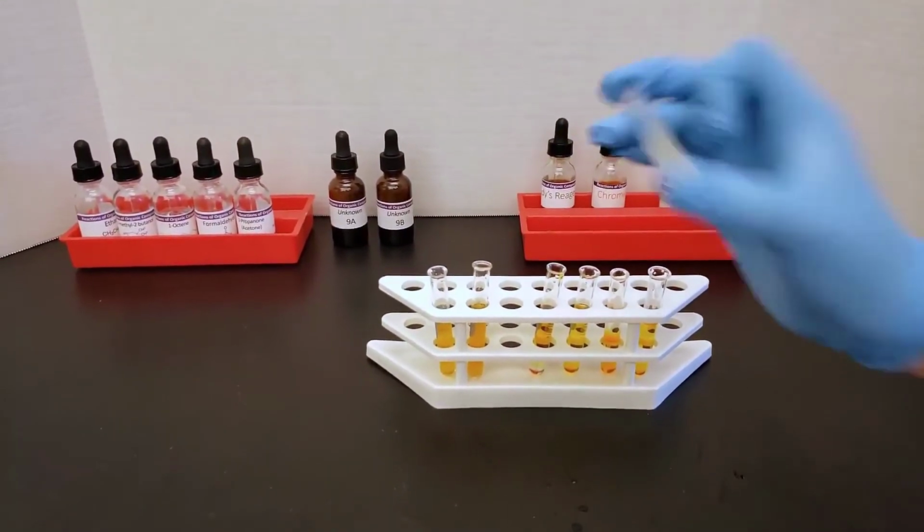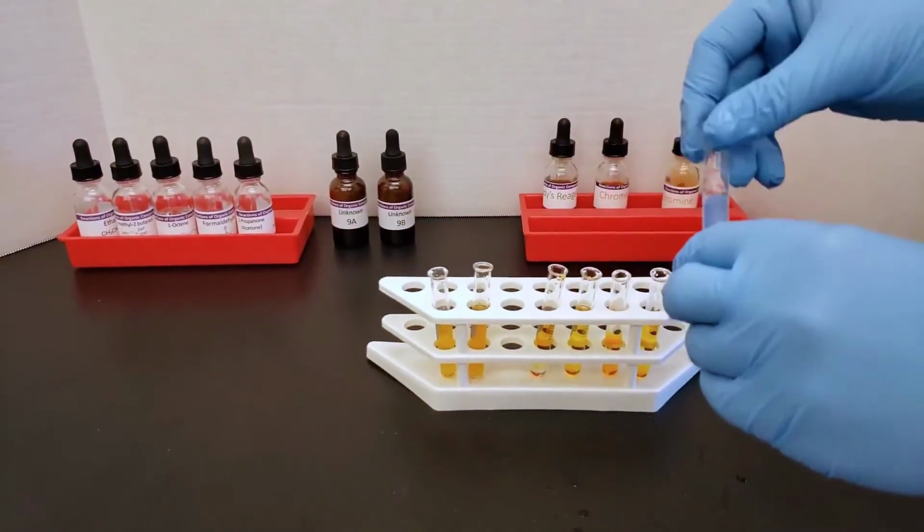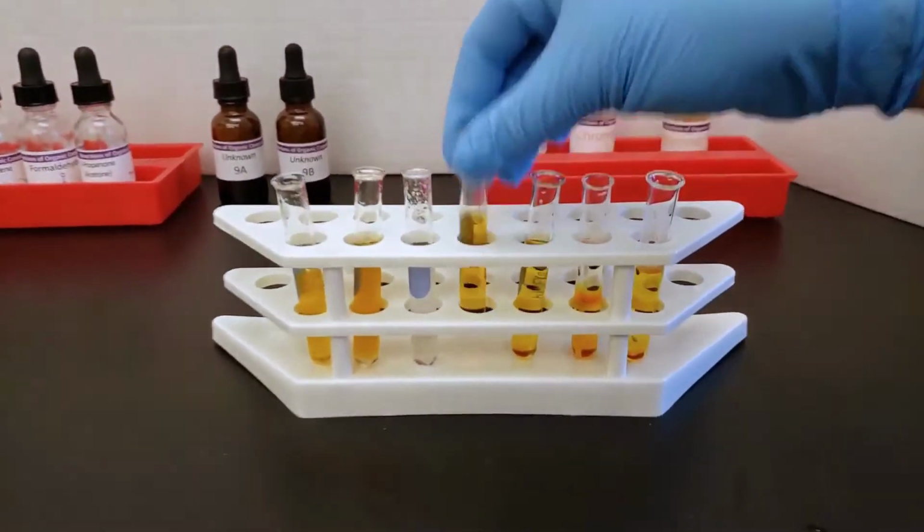However, in tube 3 we clearly see that after shaking it, the color disappears. That must be an alkene.